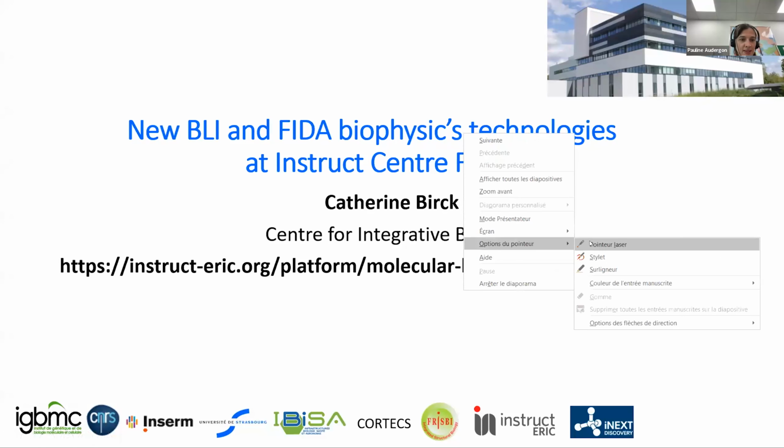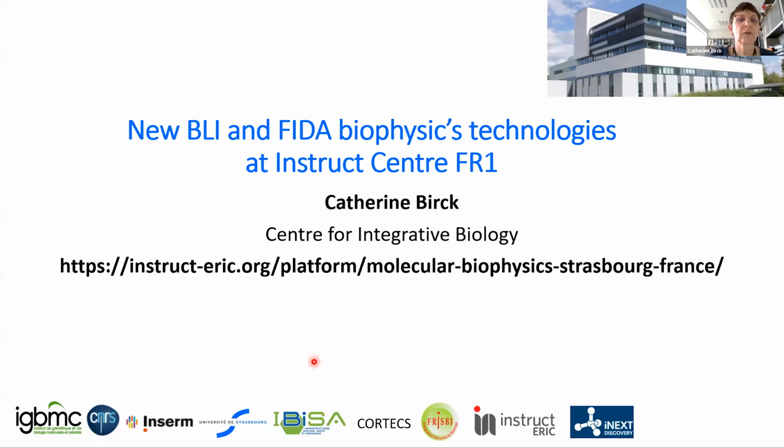So good morning. Today I will present the new BLI and FIDA biophysics technology at Instruct-ERIC France 1. Users have access to these technologies through Instruct services.